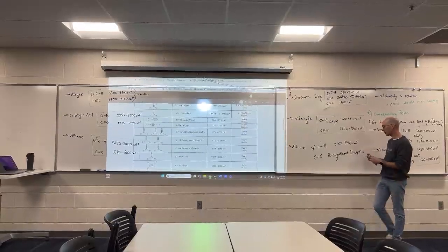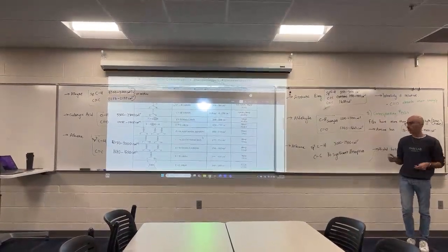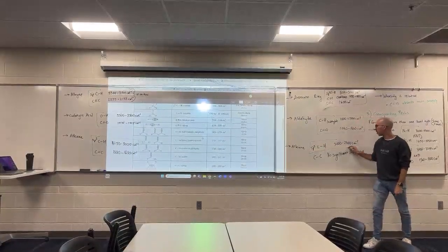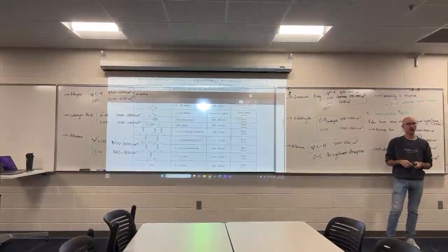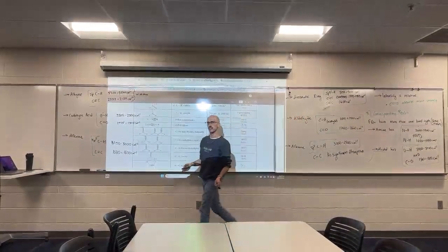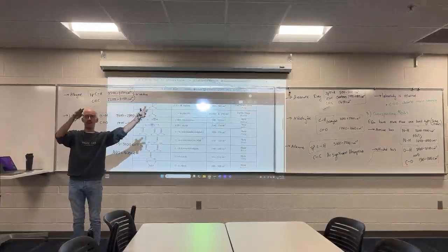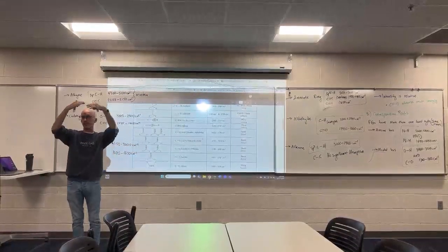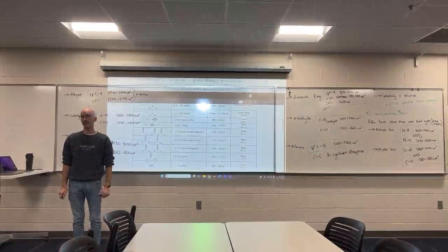So you will look at your compound and undoubtedly find CC single bonds, but there is no absorption peak to correlate to a CC single bond. So when you submit your assignment and you say, these are the signals I'm expecting to find, these are the bonds in my molecule, these are the signals I expect to see, you never have to list carbon-carbon single bonds. They don't have significant absorption.